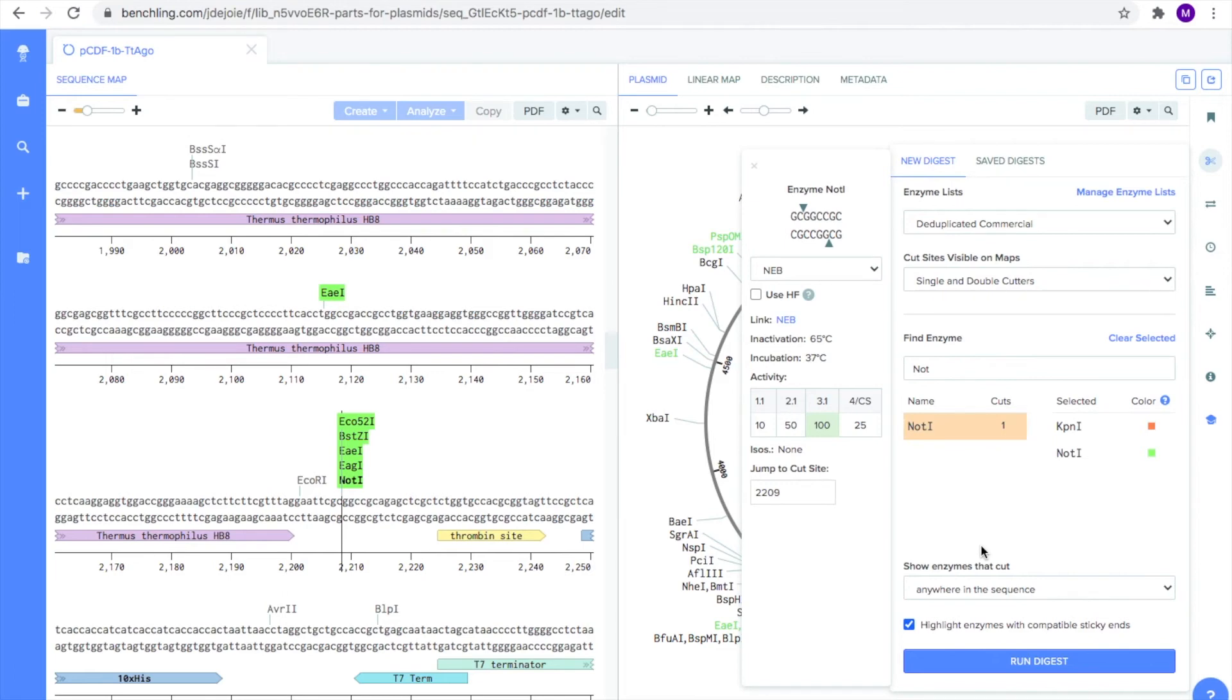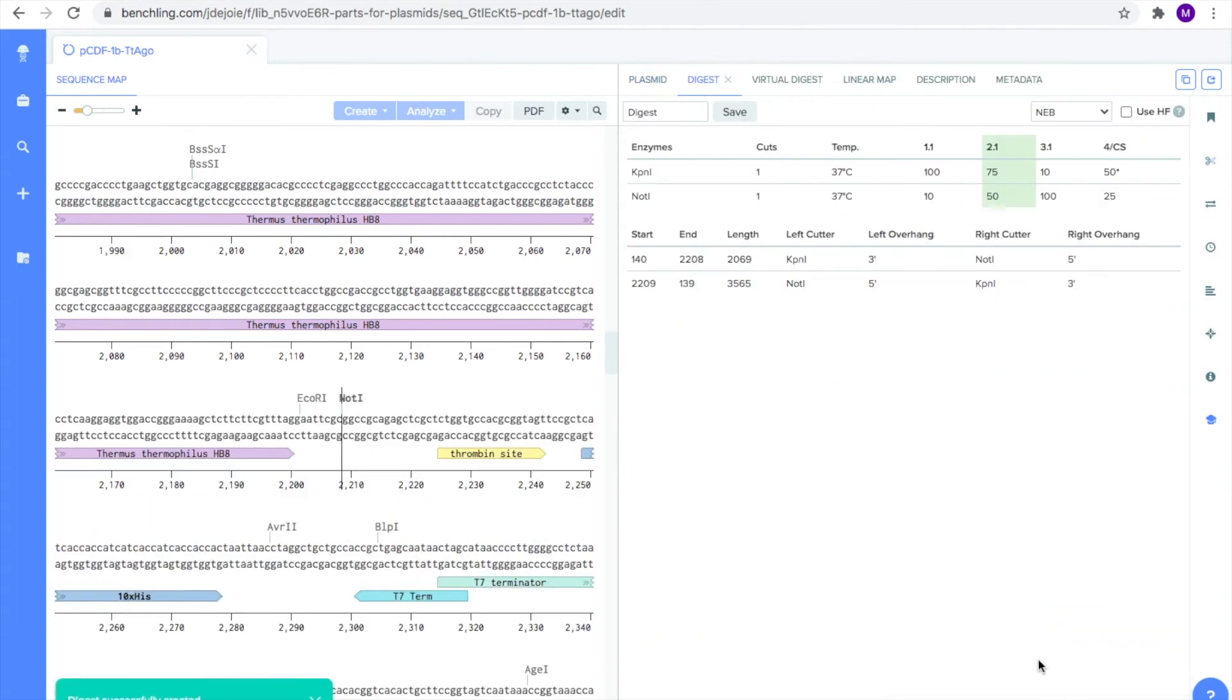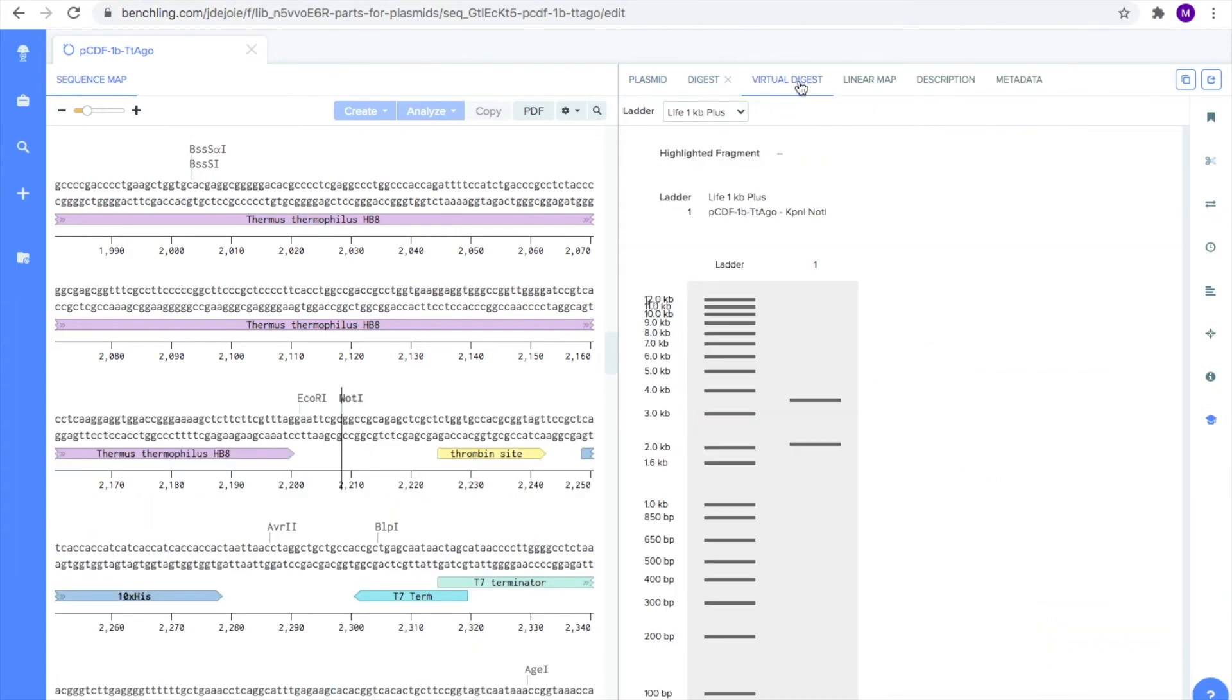After entering your two enzymes, scroll to the bottom and hit Run Digest. Then click on the tab labeled Virtual Digest. And there you go!